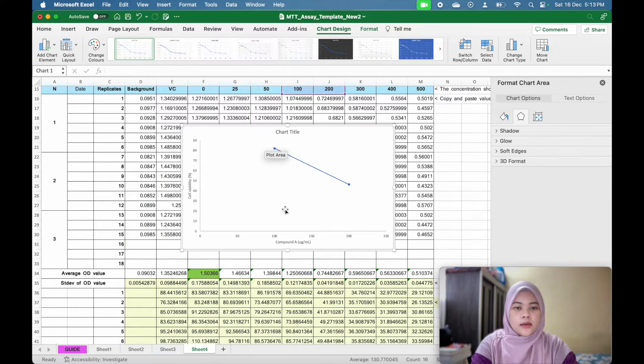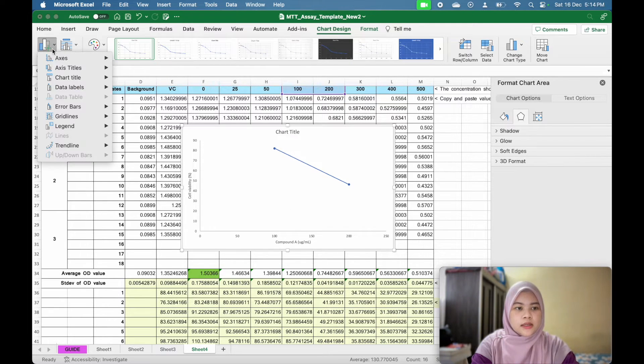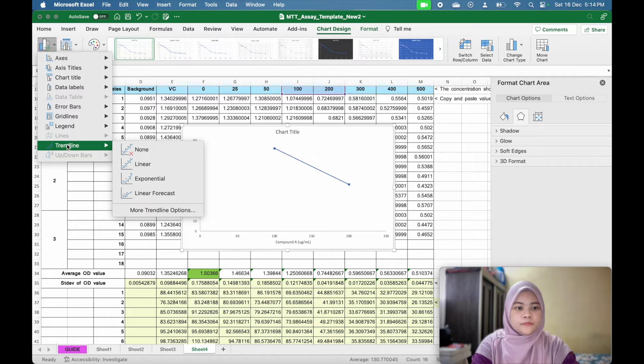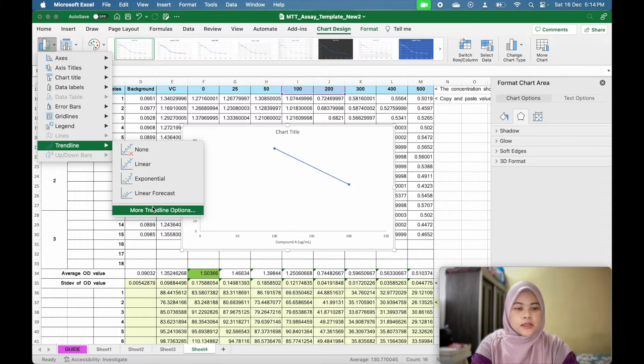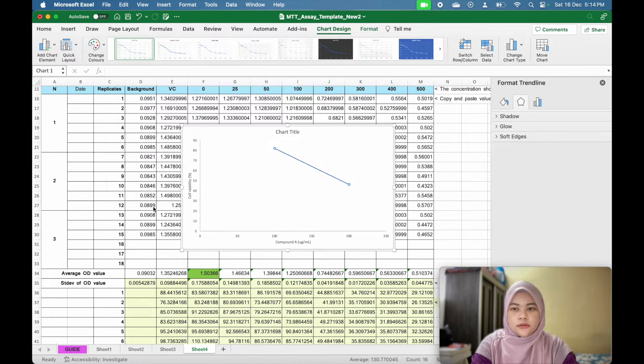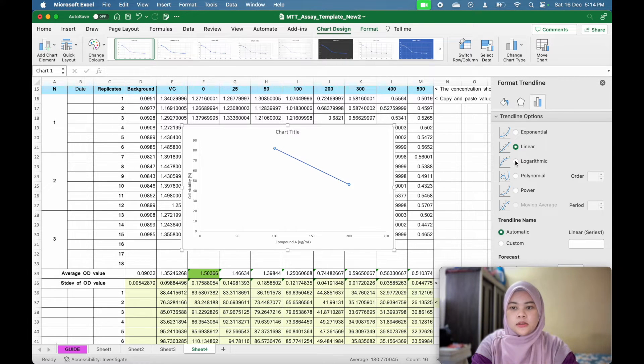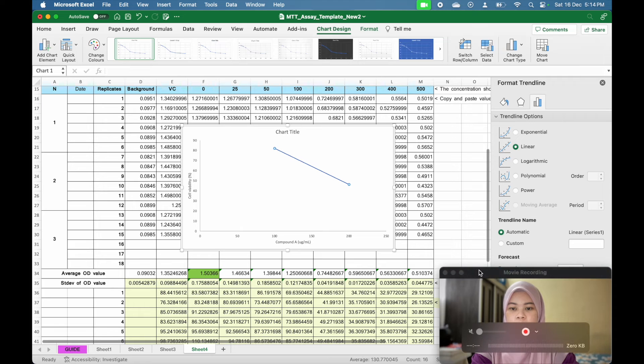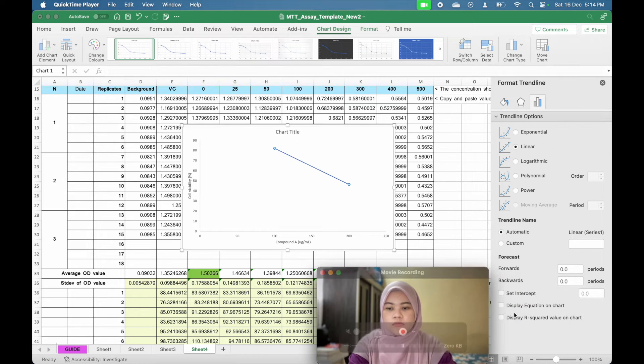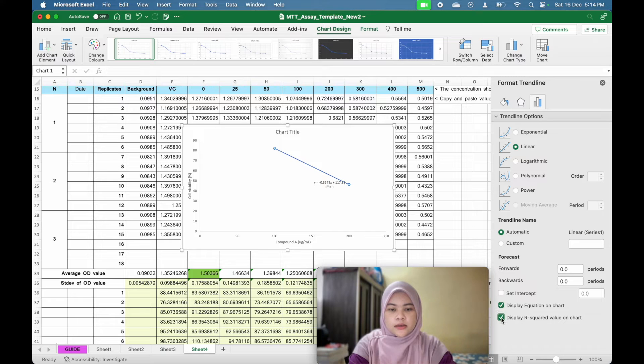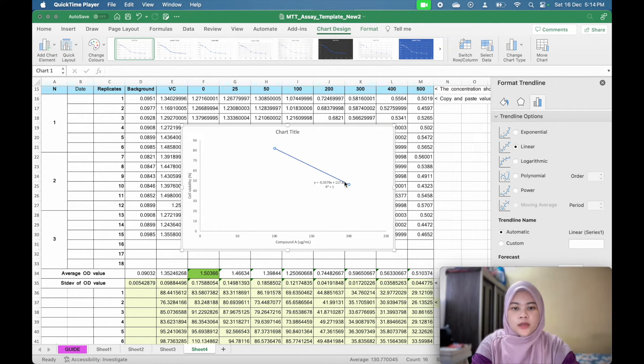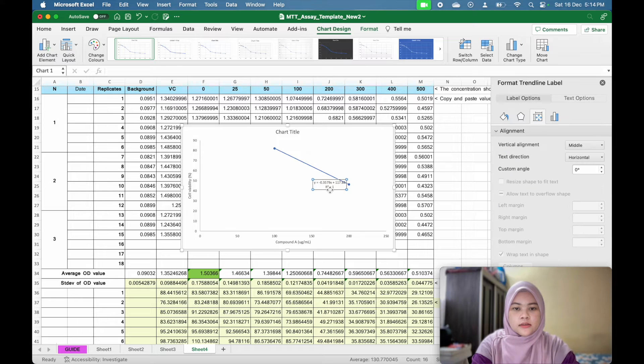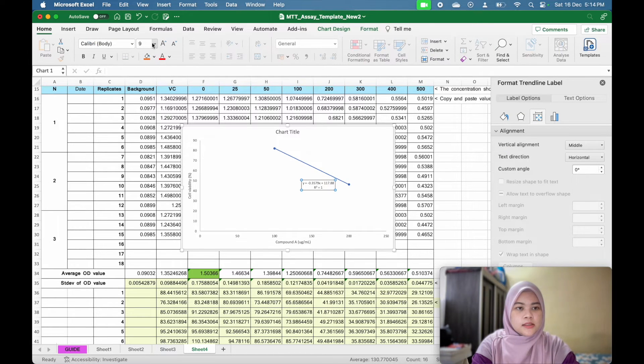So from this graph, you can find the linear equation by go to the add chart element and trendline. You select more trendline option and linear, and display equation on chart and display R square.